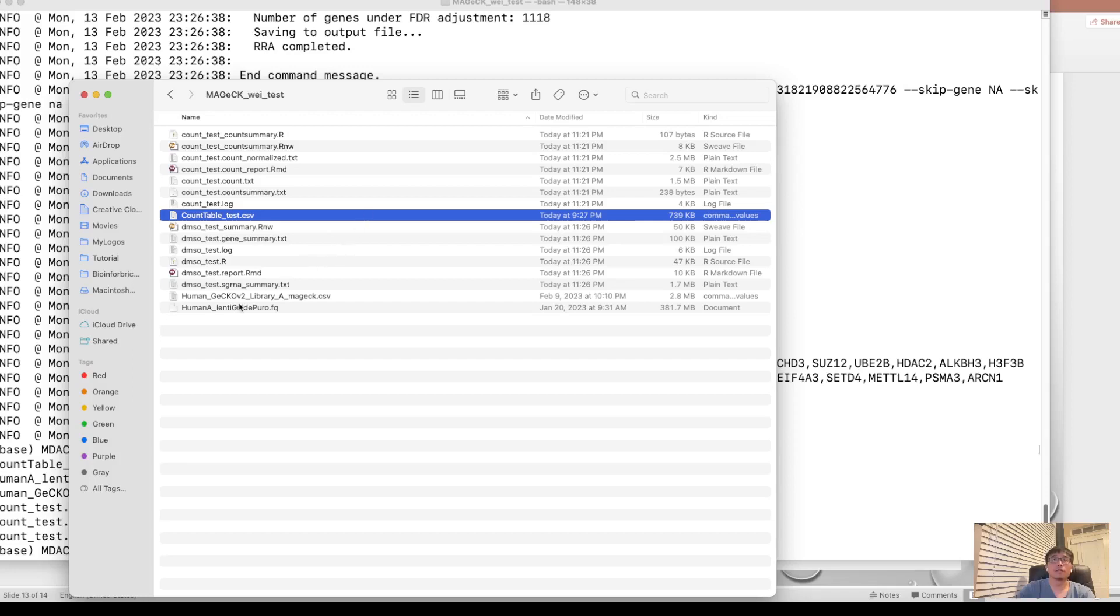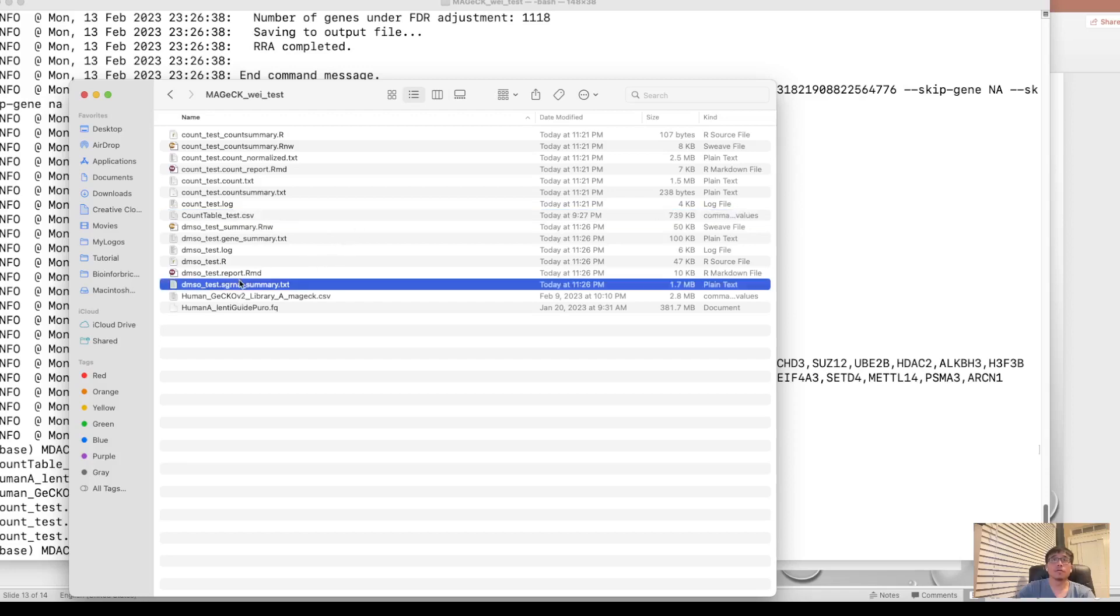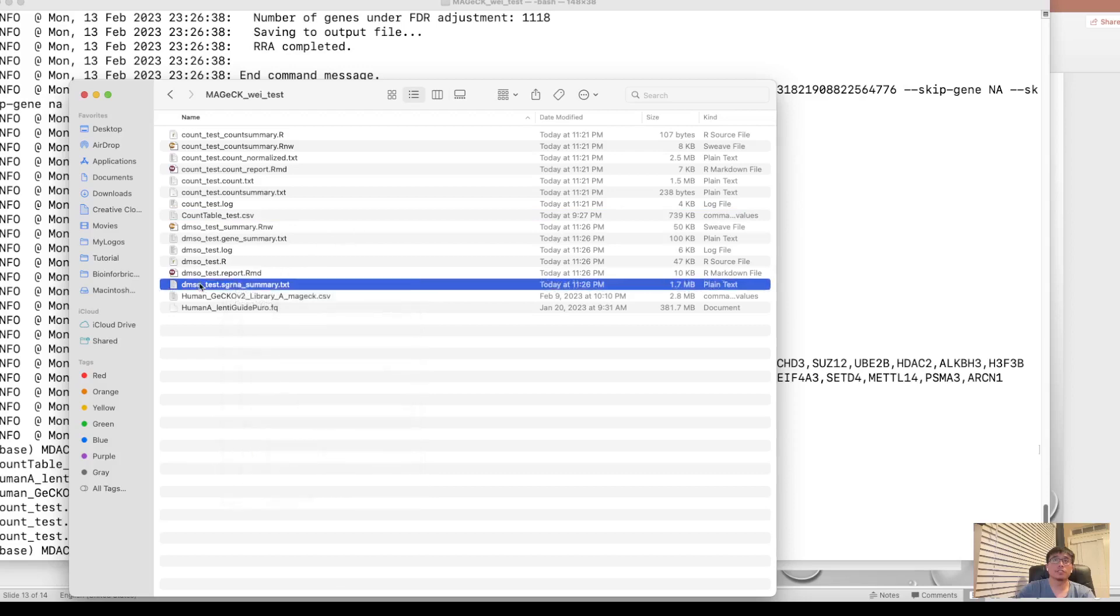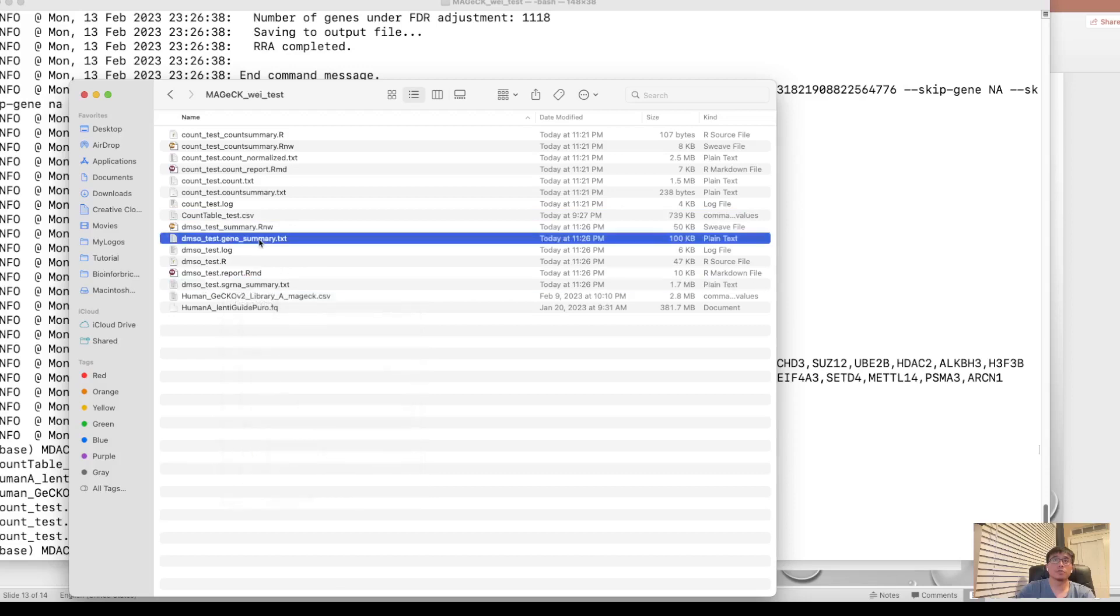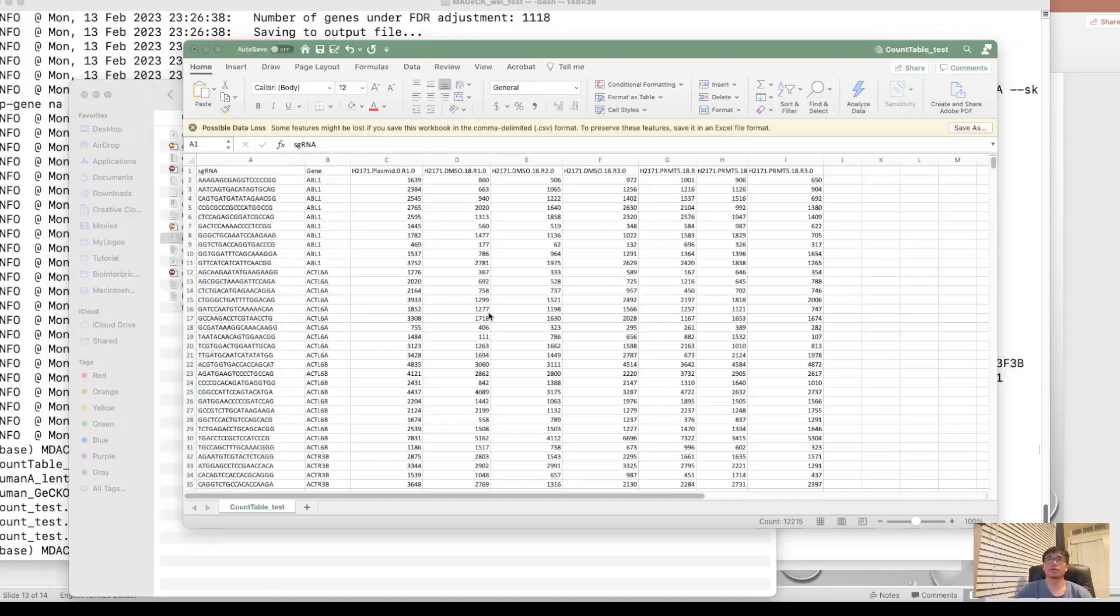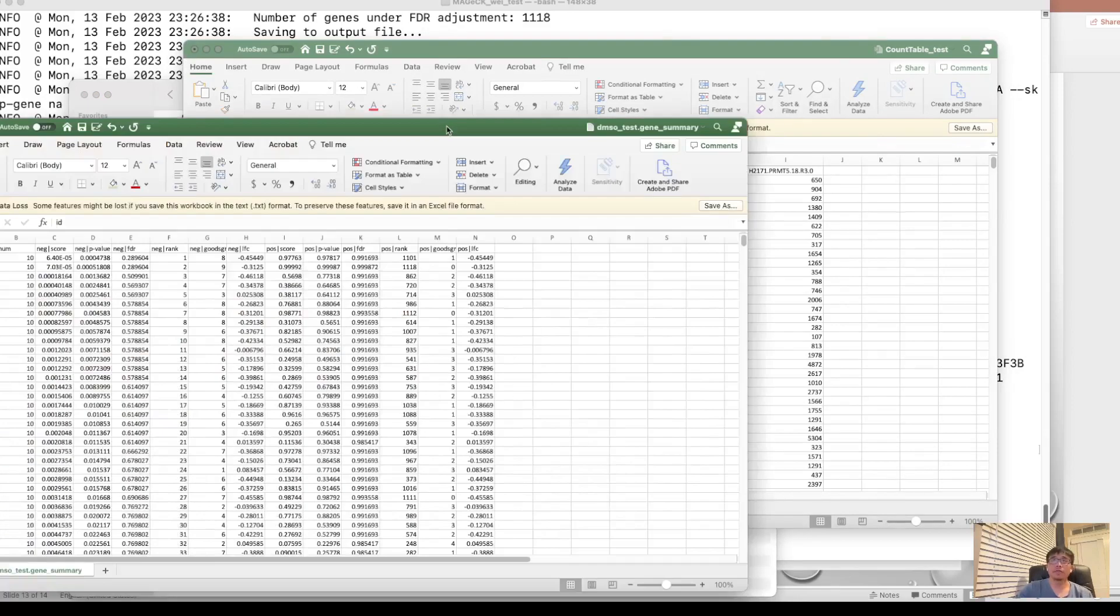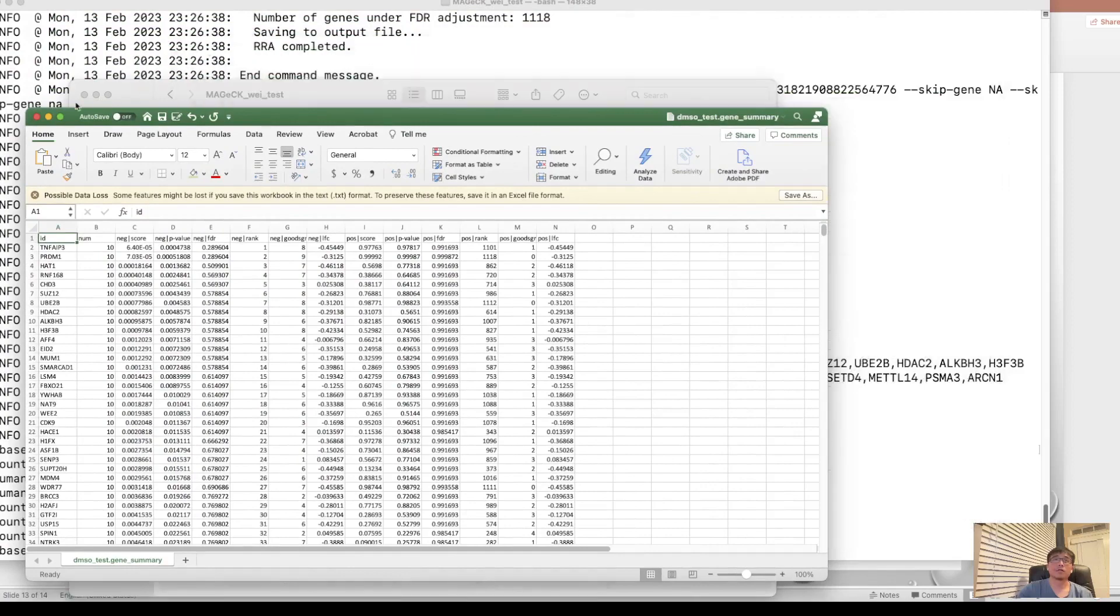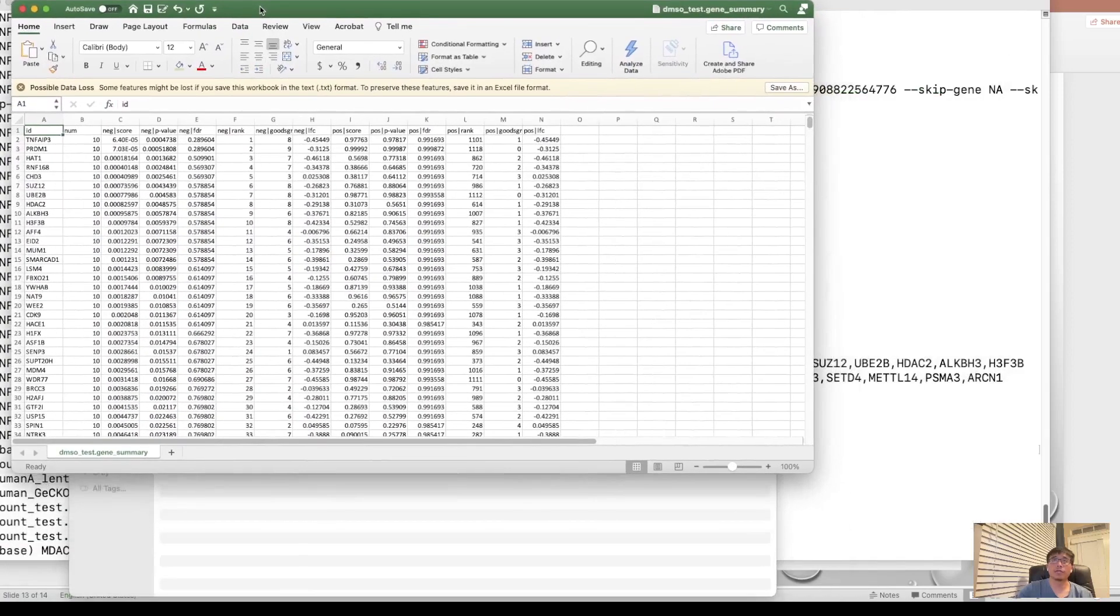DMSO test gene summary. Let's open it in an Excel file. And here is the output of the MAGeCK test.